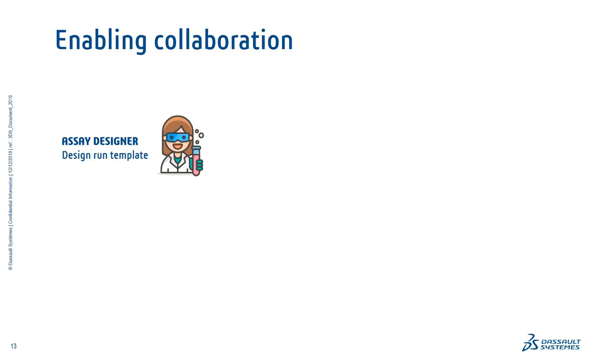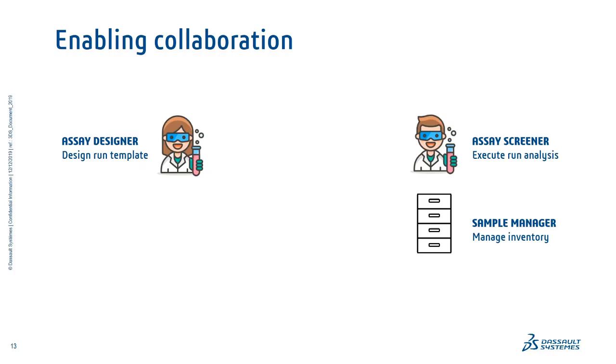So the role of the assay designer, in the context of assay in particular, will be to design a run template so that every following run executed by other members of the team, typically the assay screeners, will be made in the same conditions so that the analysis can be comparable.